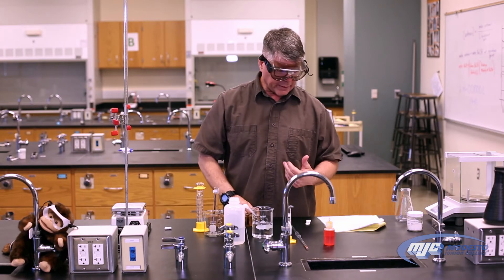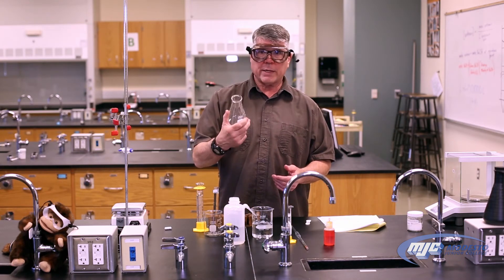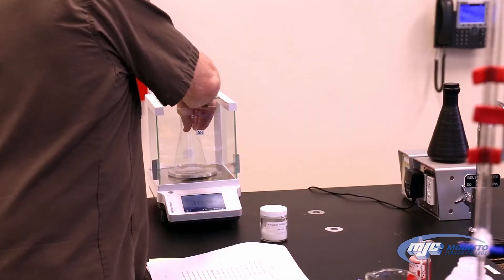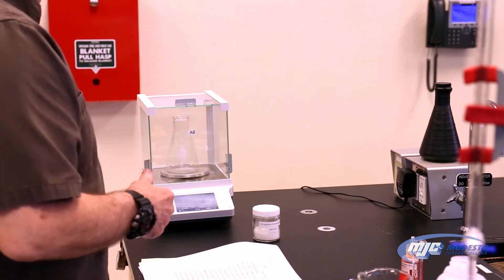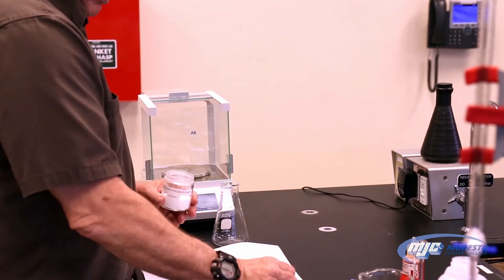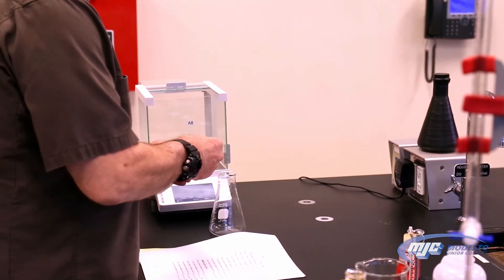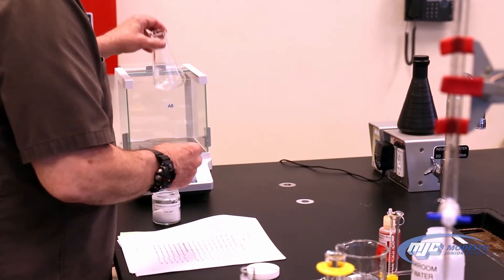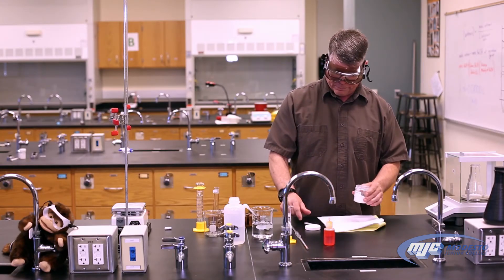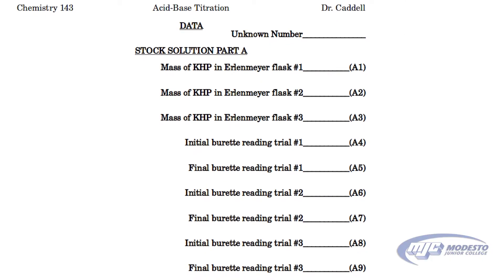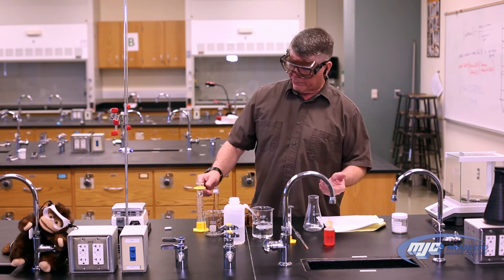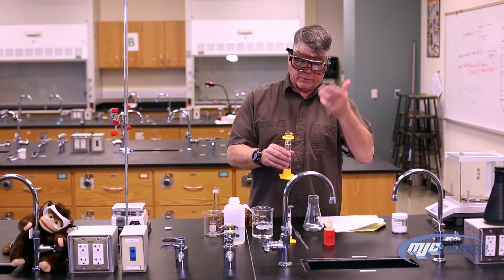The next thing we have to do is weigh out our KHP into our Erlenmeyer flasks. There are going to be three Erlenmeyer flasks — we do this part three times. We take an empty Erlenmeyer flask, put it on the balance, and tare the balance because we don't care how much the flask weighs by itself. Then we add somewhere between 1 and 1.2 grams of KHP — for example, 1.153 grams. Everyone's going to have a different number. That'll be flask A1, the second flask A2, and third flask A3. Then we add about 50 mL of deionized water — no need to measure carefully.